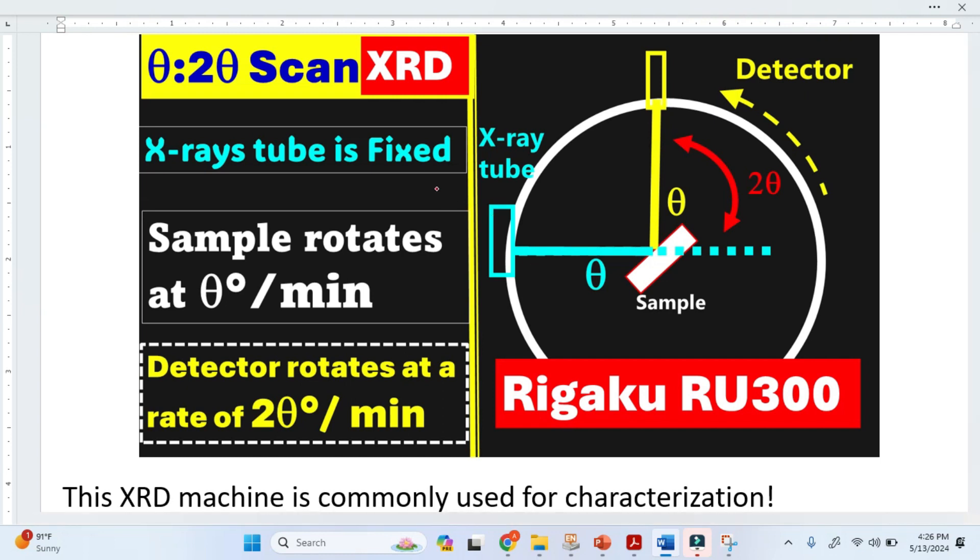As you can see, the sample has rotated to almost 45 degrees, and this 2 theta is almost 90 degrees.